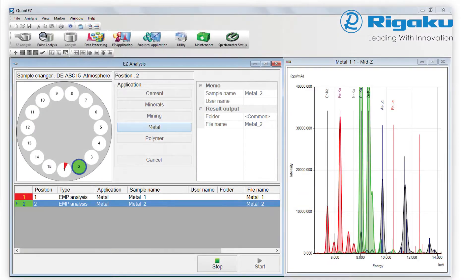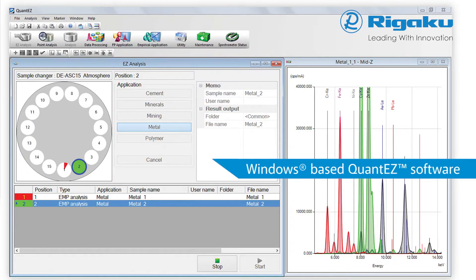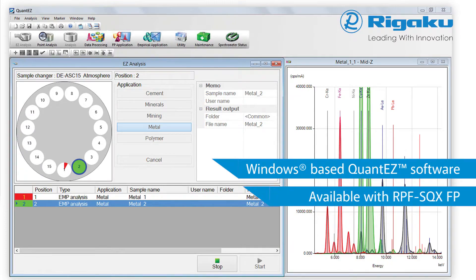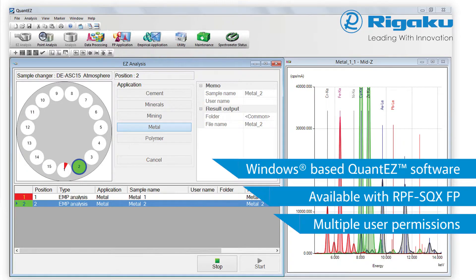RIGACU has combined extensive experience in applications development and technical knowledge to create QuantEZ, the most comprehensive EDXRF software. Both ergonomic and user-friendly, it may be equipped with RPF-SQX FP for standardless analysis.